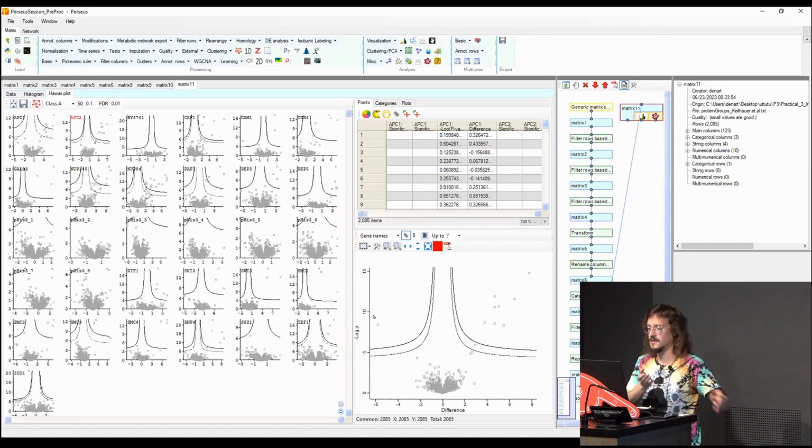Something has happened there. I would say that this is just an error that every time you do these experiments, it's also good to show that, but I would say it's that 0.1% that may always happen when you run statistics. That is an error, just a pure error. I mean, you would expect as many of these on the wrong side as you have the FDR set, basically, right? So if you look into the 1% or 5% FDR interactors, then you would actually expect 5% of them to be wrong, and so we'd also expect 5% on the wrong side to show up.